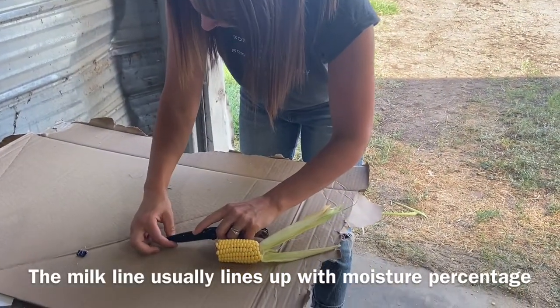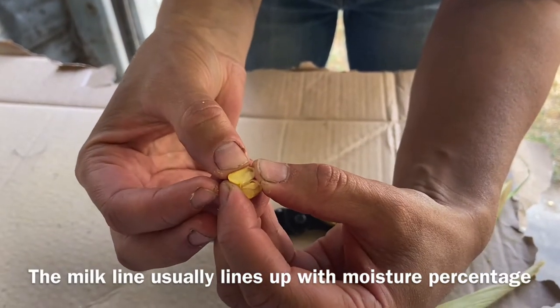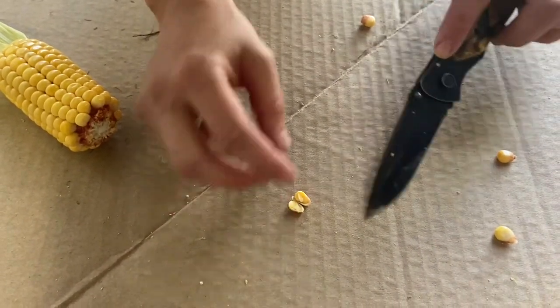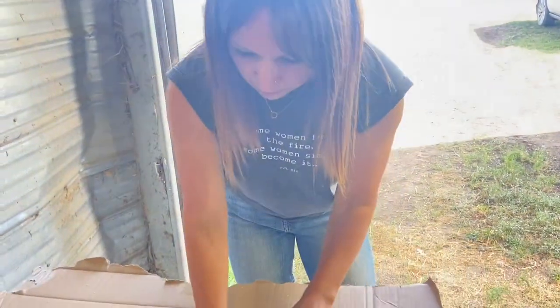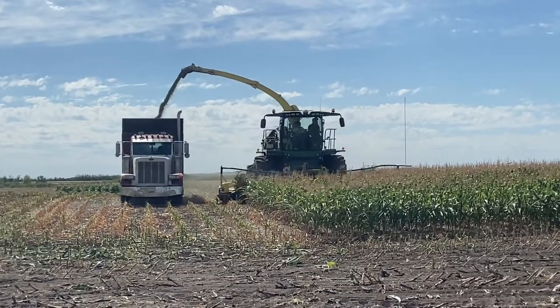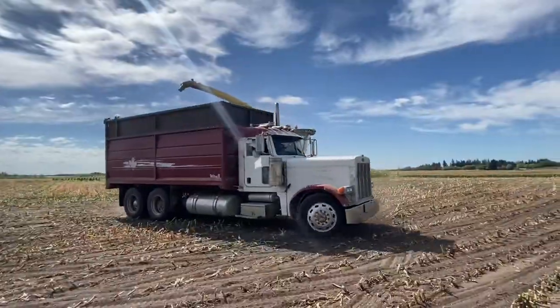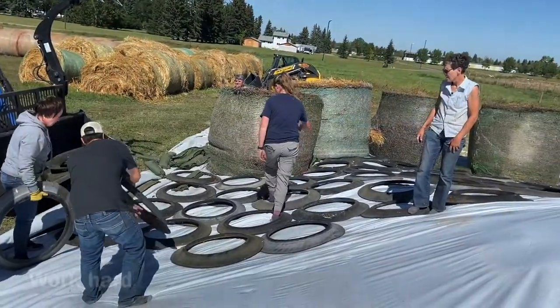I'm just going to cut the kernel in half so you can see the starch in there. There is starch all the way through but there is still moisture. Sometimes I'll just take the kernel and bite it to see where I get milk. I get milk just before the middle — I get pops — so you're close to 50% milk line.